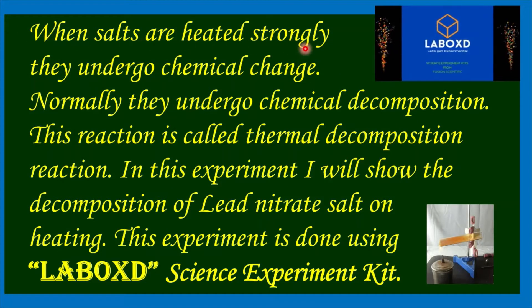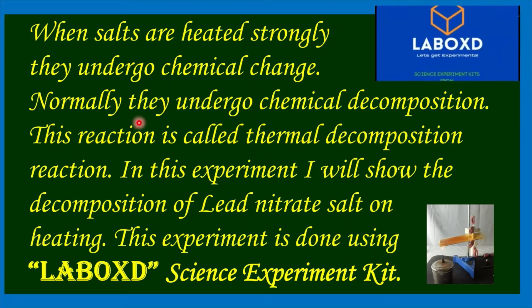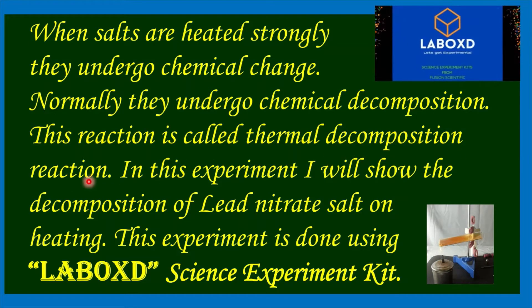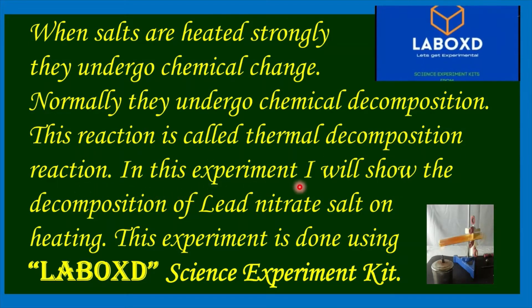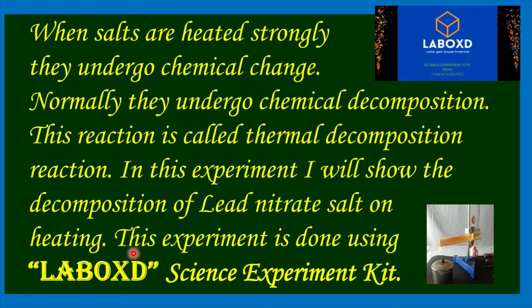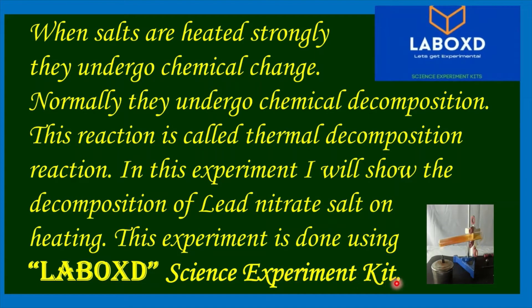When salts are heated strongly, they undergo chemical change. Normally, they undergo chemical decomposition. This reaction is called thermal decomposition reaction. In this experiment, I will show the decomposition of lead nitrate salt on heating. This experiment is done using the LABOXD science experiment kit.